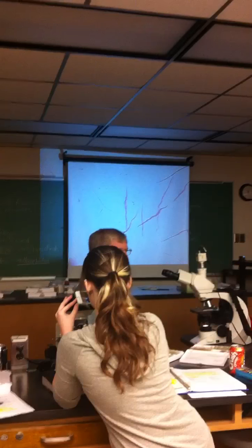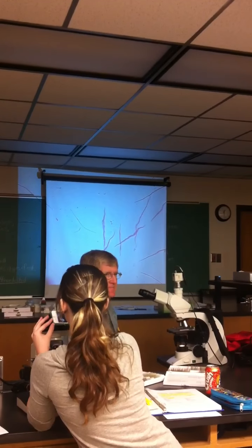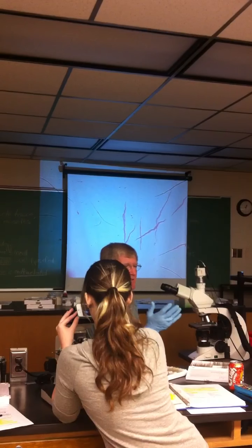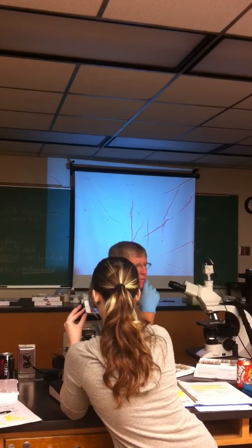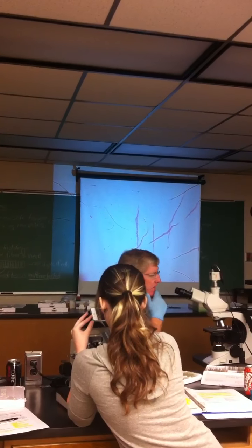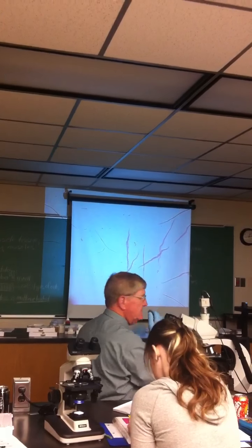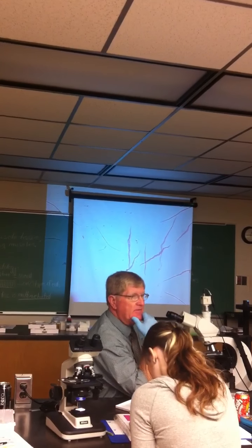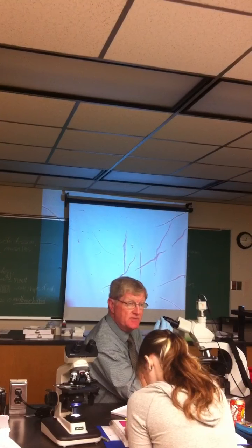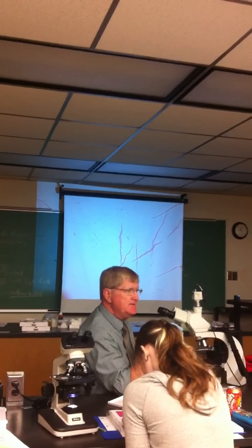All right, now what kind of muscle tissue is this? And you should be able to answer that by elimination. Smooth muscle. It's smooth muscle tissue. There's three types. We've seen the cardiac and the skeletal already. Or you could refer to that chart right there, and this looks a whole lot like the middle diagram. But look at the shape of the cells. Long, thin, and tapered on the ends.